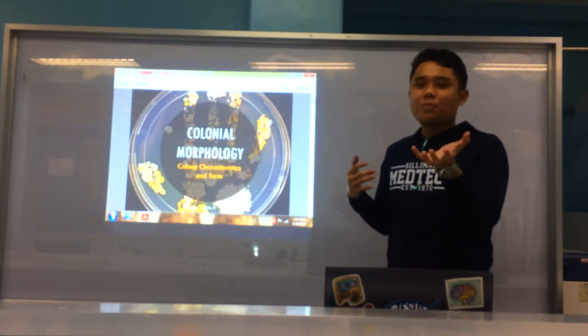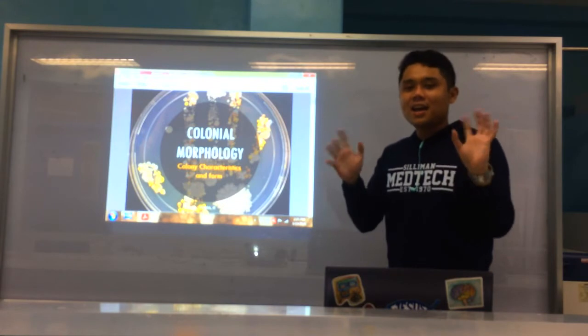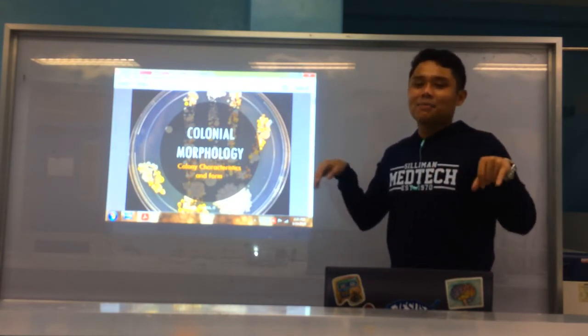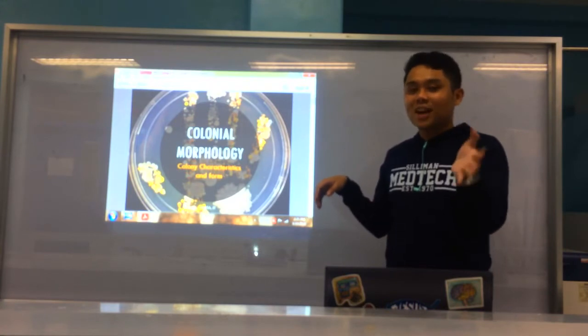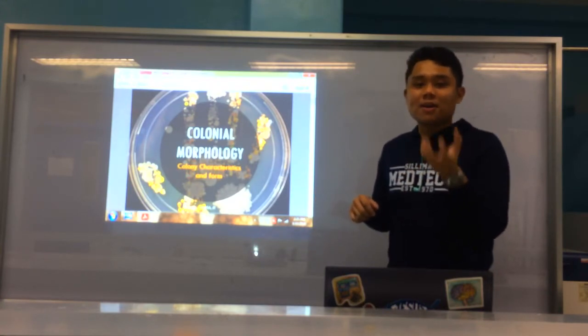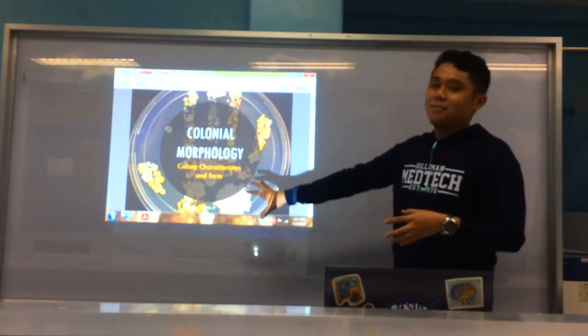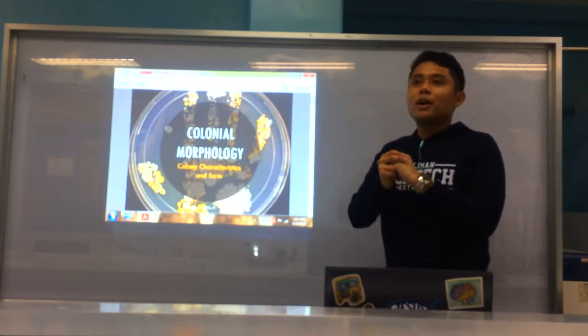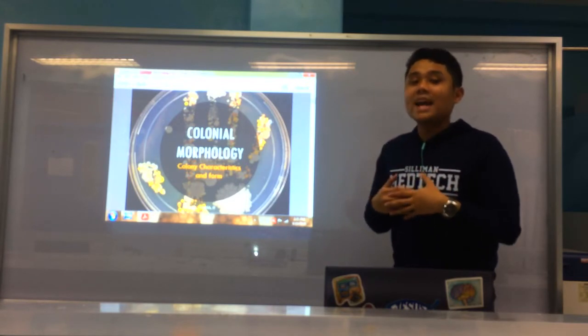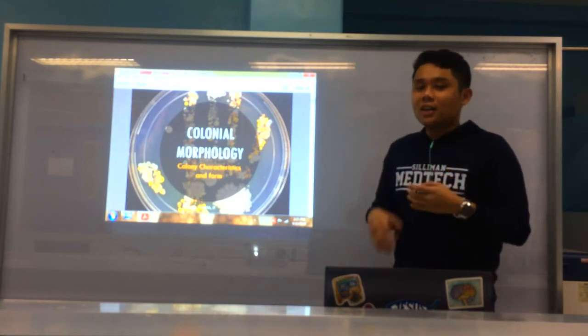After our pure culture techniques, we cultured and grew our plates of bacteria. But we don't stop there, right? After we grow them on our culture media plates, we get to describe the colonies. Furthermore, in a way, that would aid us in the identification of our organism.